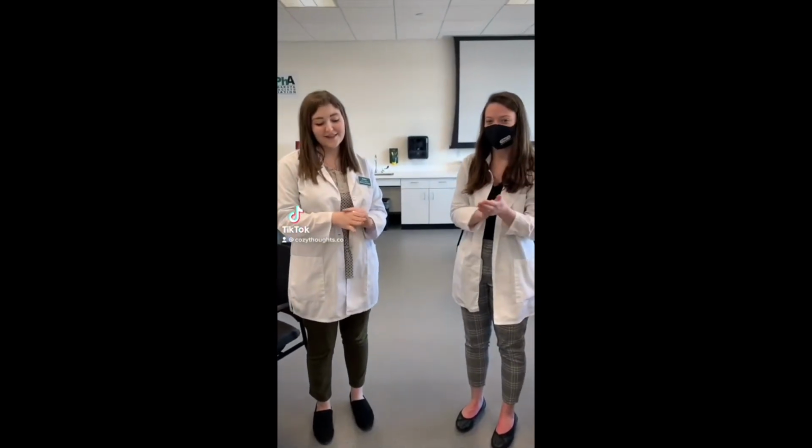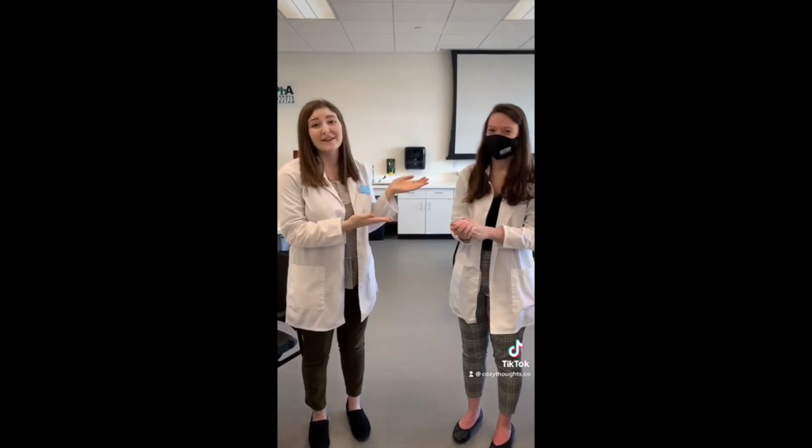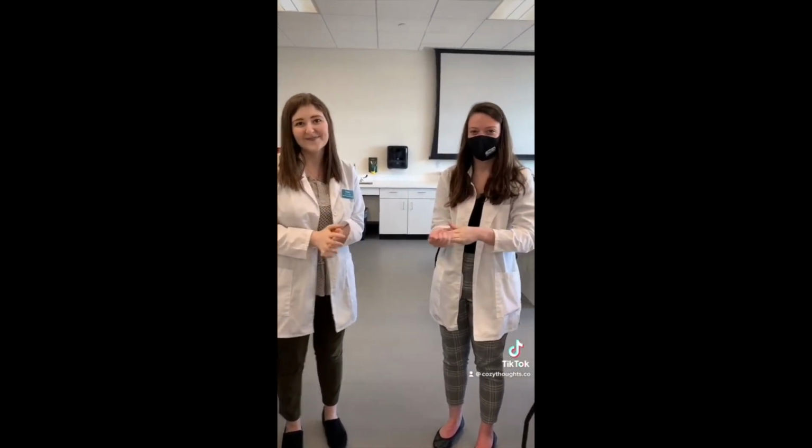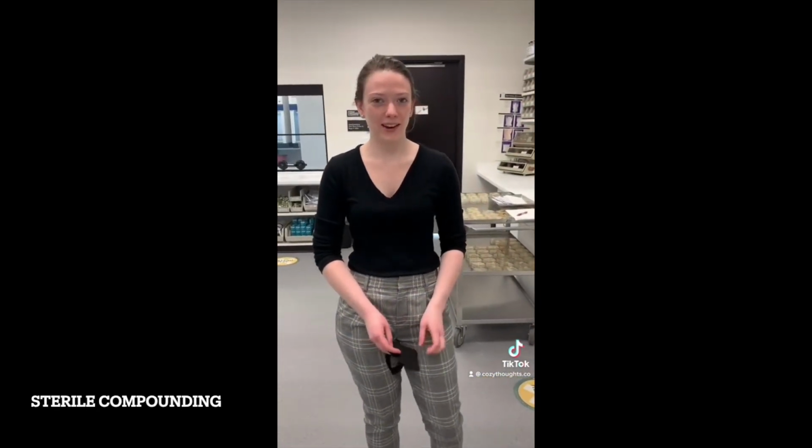Hope you've enjoyed this part of non-sterile compounding. Now we're going to move to Taylor with sterile compounding. So now we will be doing sterile compounding, which is making an IV in the IV hood. So let's just get started and come garb with me.